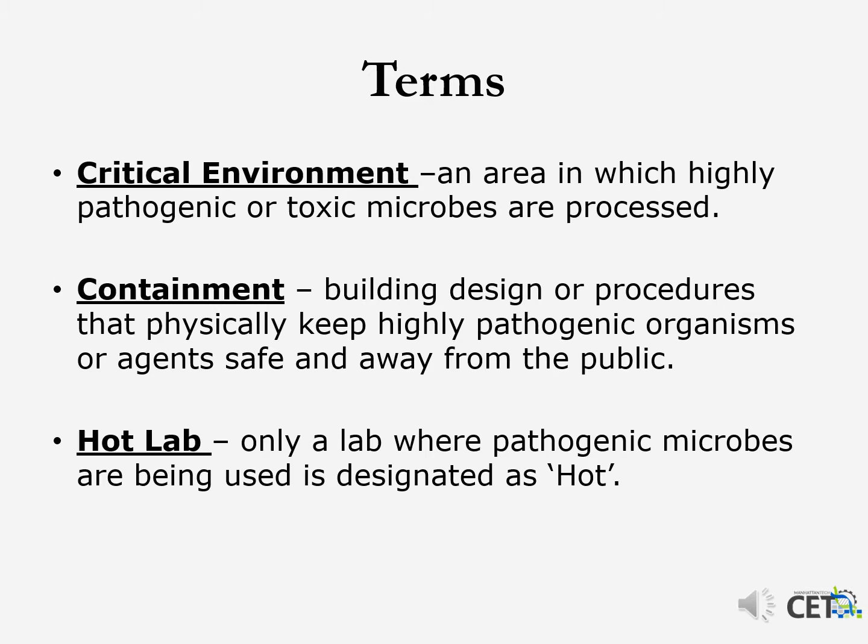The primary challenges working with microbes are contamination and aerosols, so we work on them in rooms that we call critical environments. The critical word is not about the room, but about the work we're doing and the microbes we're using. The way we handle that challenge is by containing those microbes or the contamination or the aerosol. And we do that either structurally by isolating that room, or mechanically with airflow, and sometimes with personal safety equipment.